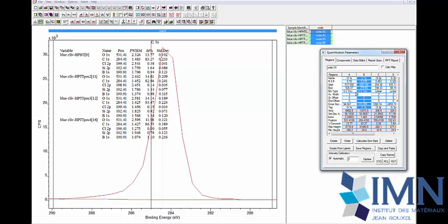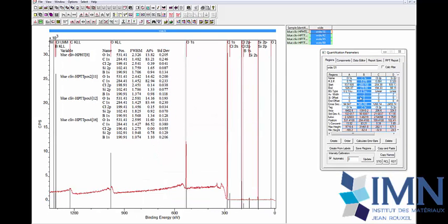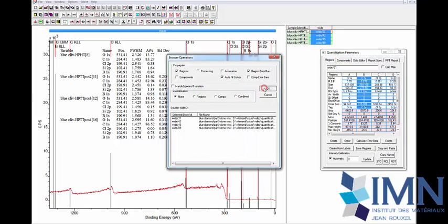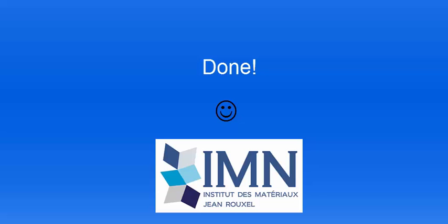Of course, sometimes it's not necessary. If you try to improve the carbon, the intensity is so high that you don't need to have too many points left and right to have a good knowledge. It will not give you any improvement. But uncertainty is a very good way to try to extract more reliable information from your data. Thank you very much for your attention.